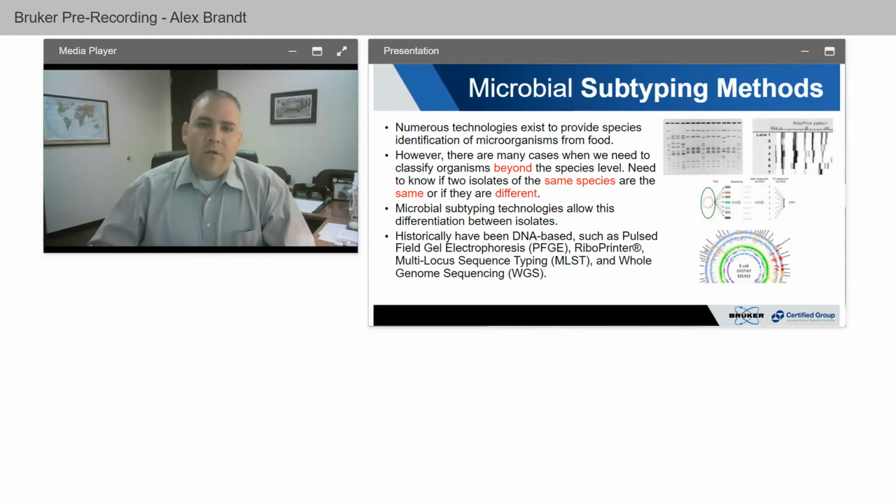So how do we do this? Well, there are various subtyping methods where we are able to look really deeply at the strain of the organism. There are a lot of technologies that exist to provide the species identification of microorganisms from food. However, there are many cases where we need to classify organisms beyond the species level. We need to know if two isolates of the same species are the same or if they're different. That's where microbial subtyping technologies come in, and they allow us to do this differentiation between isolates.